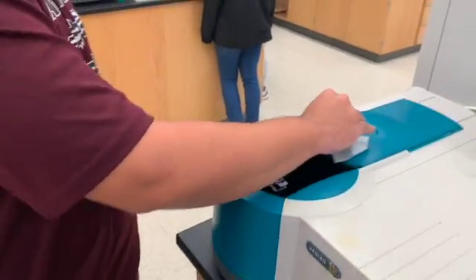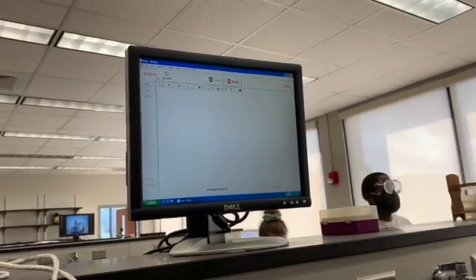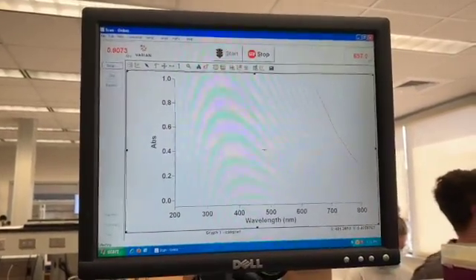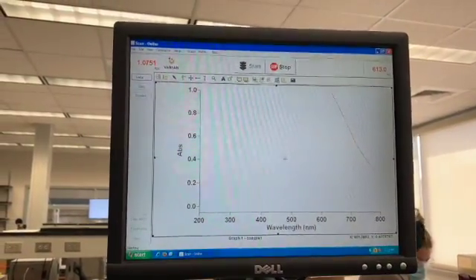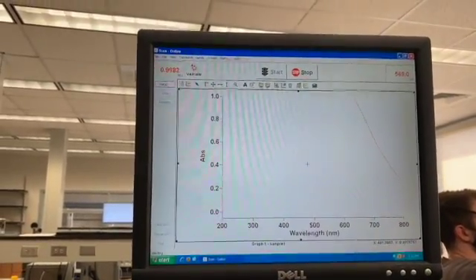We use this feature to determine a usable wavelength for copper amine and to get the absorbance chart, which is unique to the solution. Once we get our graph, we determine the wavelength with the highest absorbance to use on the Quick Reads program.